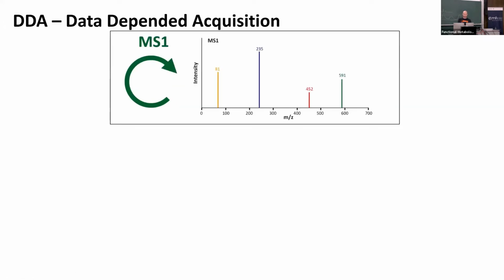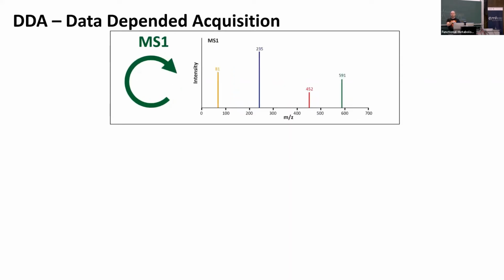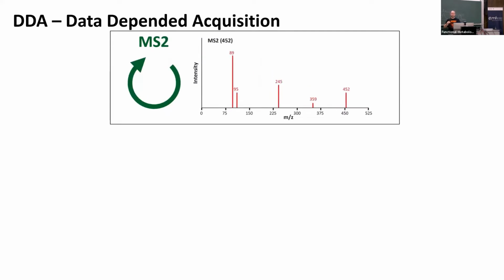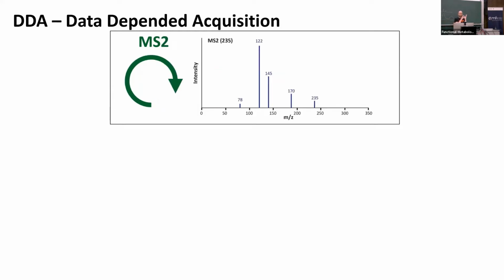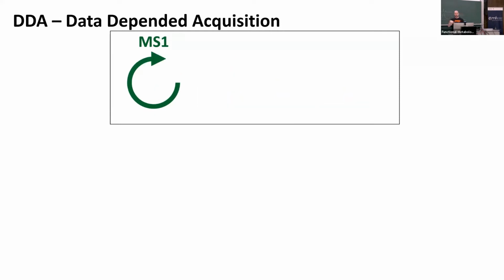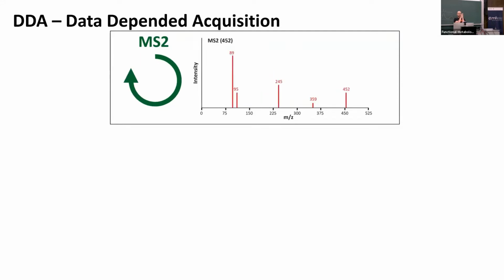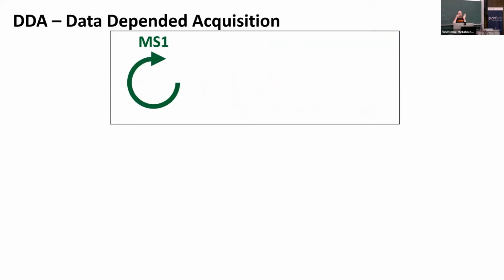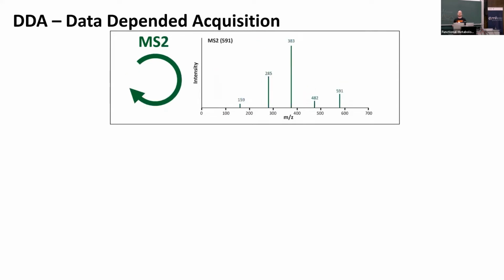But yeah, so again, we want to set up a data-dependent acquisition method. And I'm going to reiterate on that because that's a really important take-home message for us. Data-dependent acquisition basically acquires MS-MS spectra depending on what MS1 masses are observed, right? And it cycles through duty cycles in which it does one MS1 precursor scan. And then depending on what peaks there are, it subjects those to the next MS-MS events.